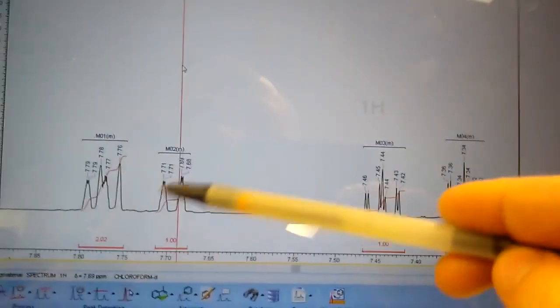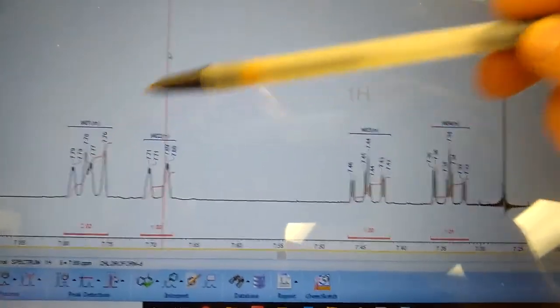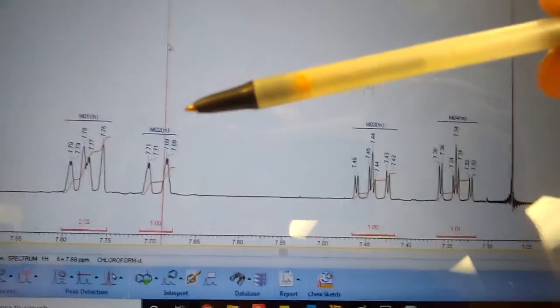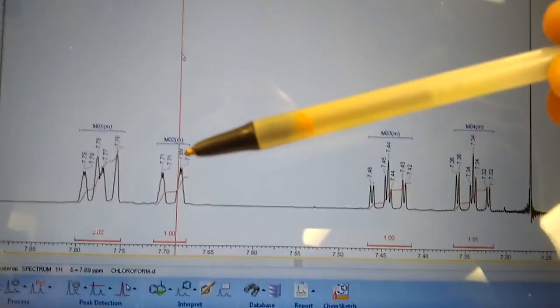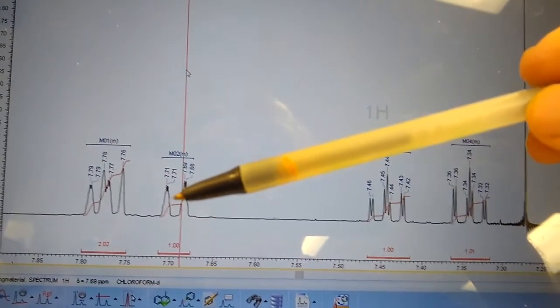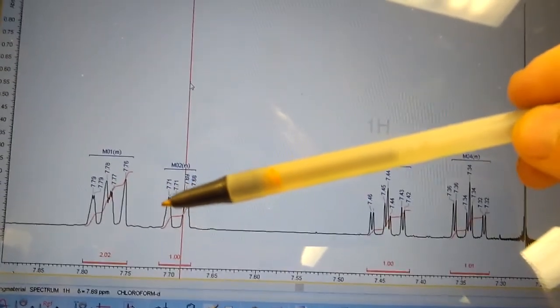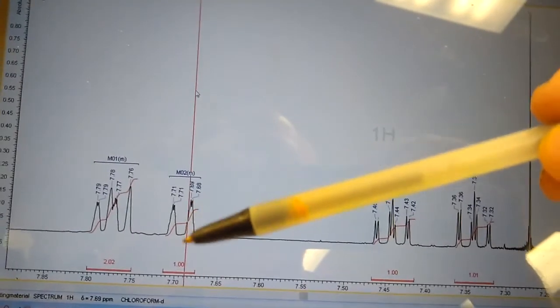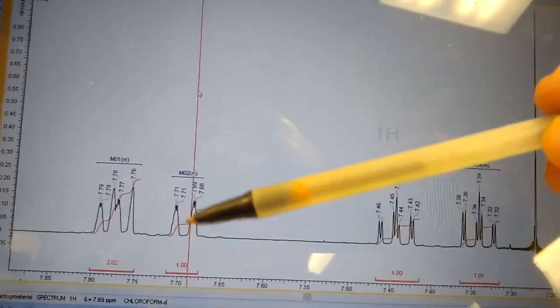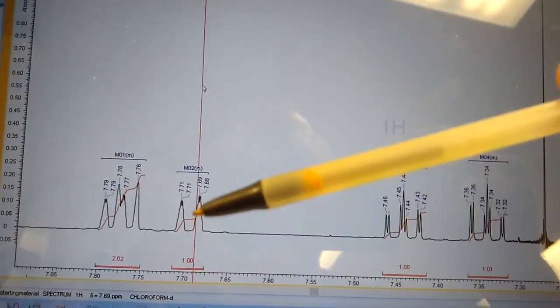Regarding splitting or multiplicity when talking about these signals, some of them are easy to tell. Like this would be a doublet where you've got two kind of equal intensity signals. We'll talk about why this splits in a minute. So that signal would be a one H doublet.